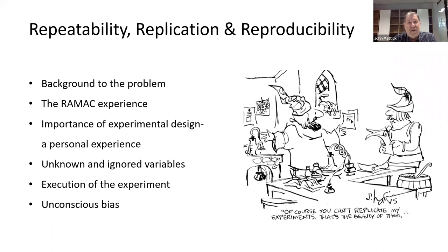And the third thing I'd say is to reinforce again what Helen was saying. Imagine not just trying to advise your successor how to do the experiments that you've been doing, but how to program a robot to do it. If you had to say, just using verbal commands to a robot, that you wanted to take 5 different cell lines with 100 different conditions in microtiter plates and do these assays, it might be luciferase, it might be RNA-seq or whatever, how would you provide sufficient information to that robot, or another individual, that they could execute the experiment without having to guess some of the steps? And that means it would be reproducible.